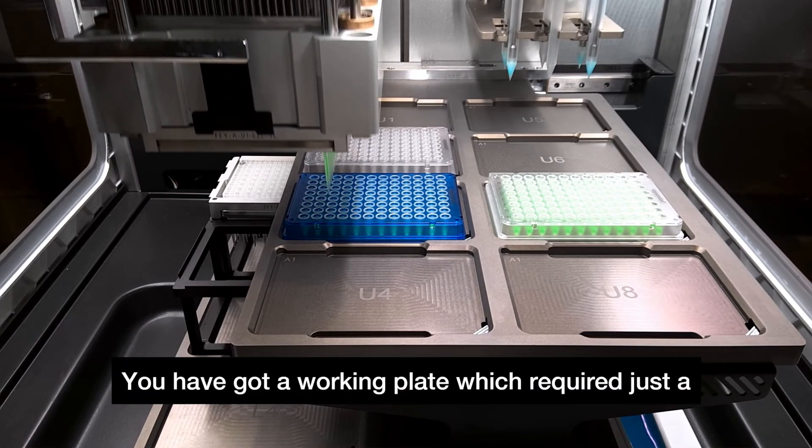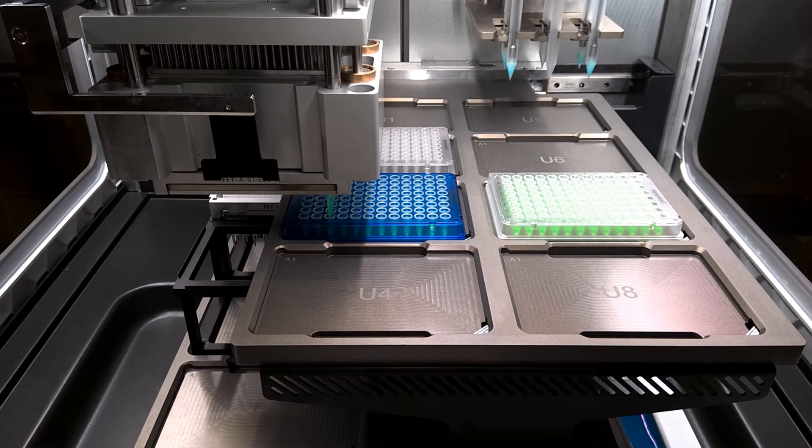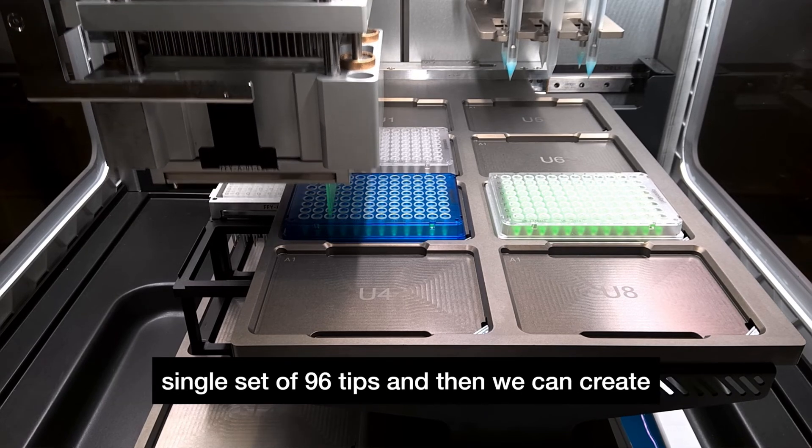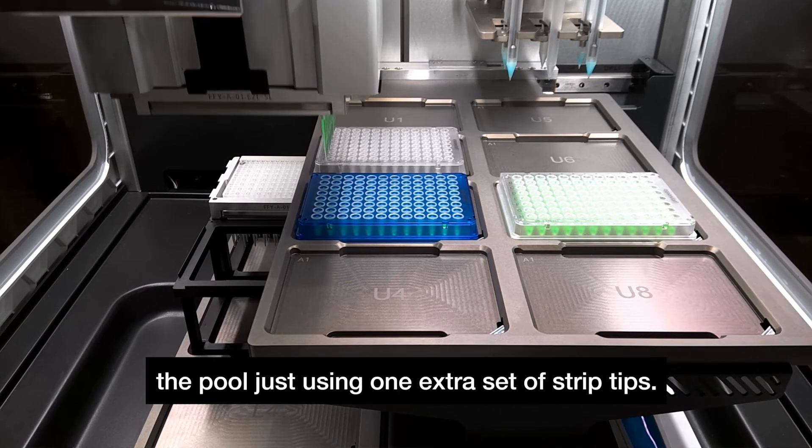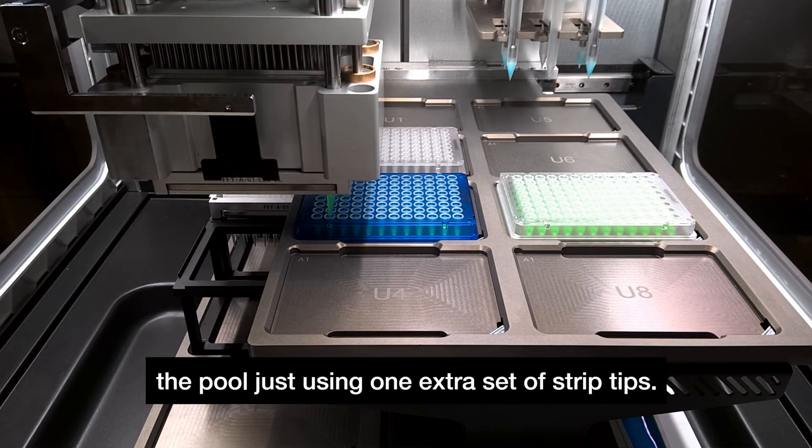You've got a working plate which required just a single set of 96 tips and then we can create the pool just using one extra set of strip tips.